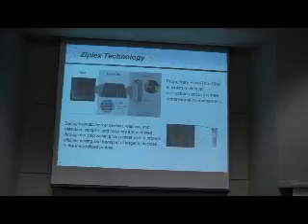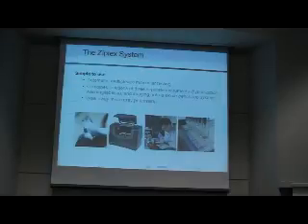The Ziplex technology, as I mentioned, is an array. Basically, on the tip of that little pipette is an array with about 500 features on it. Each of those features has about 70 channels of a 10 micron size that allow flow through it. And that basically allows you to use that in an automated fashion and do things like hybridization much faster than you would using a traditional array.